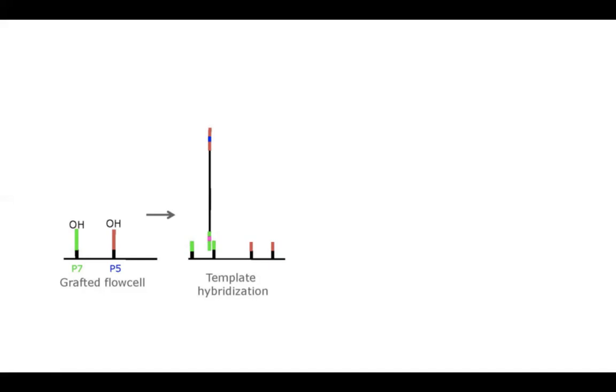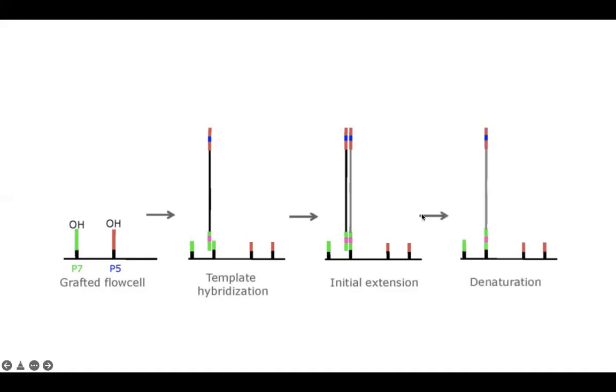And in the next step, this needs to be amplified again on the flow cell, which is done with a so-called cluster PCR, bridge PCR also known, in which the first strand, of course, is just made in single. So the oligo that is bound to the flow cell is elongated. And then after denaturing, so this is again heated, the black strand in this case will be single-stranded again and washed away, and ending up is a single strand of cDNA, which is covalently bound to the flow cell. So that is the first strand.